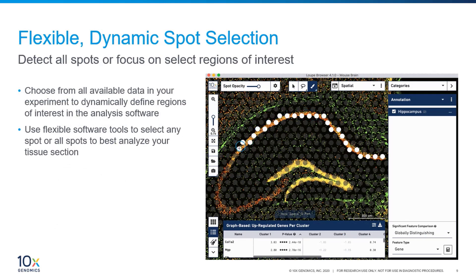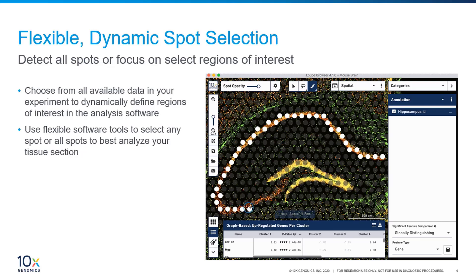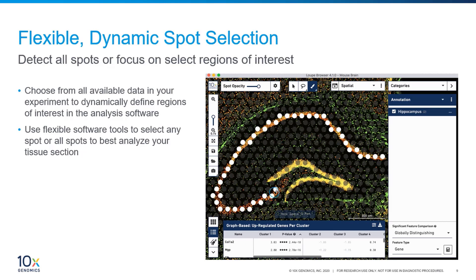Here we have a representation of how you might analyze your data with Loupe Browser. In this example we have a mouse brain section where we can visually identify the hippocampus, shown by the C-shaped structure in orange. To identify all the genes that are upregulated in the hippocampus, simply select the spots that overlay onto this structure. As we have transcriptomic expression information for each of these spots, the software can perform analysis such as differential gene expression between the selected spots and the rest of the sample.